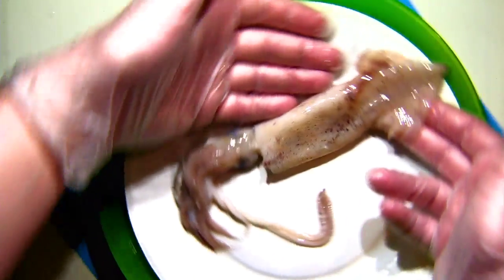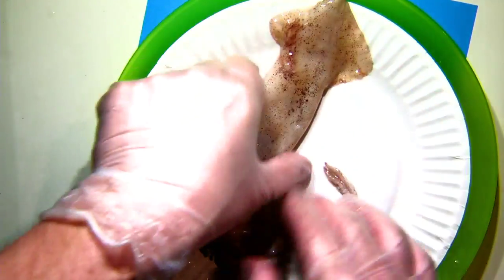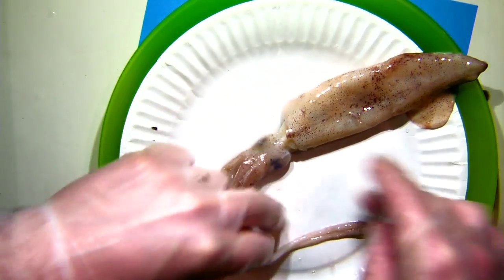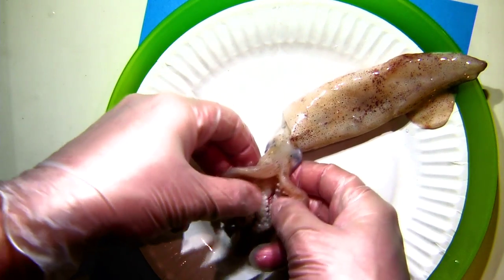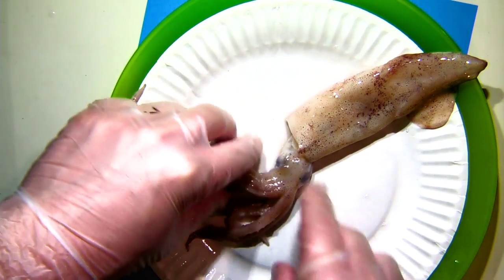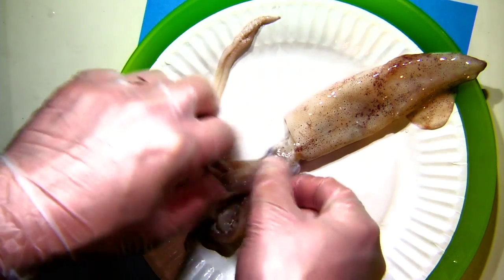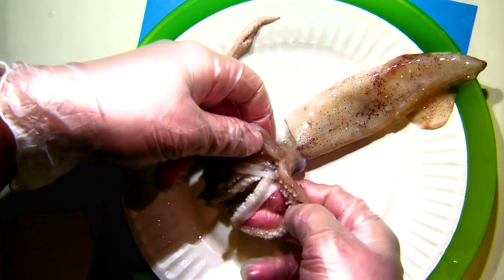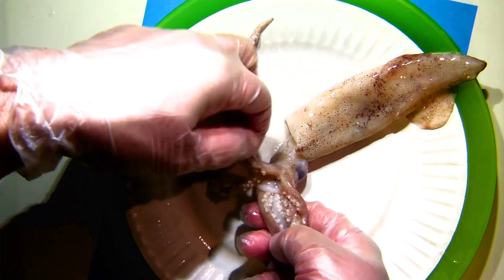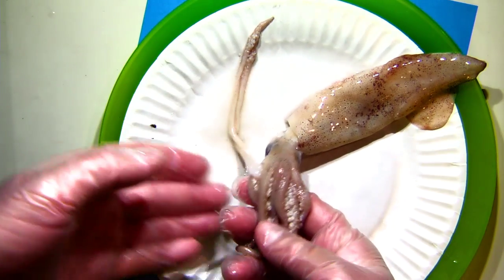We'll talk about how those fins work in a minute. You can also see sticking out the other end — we've got some arms. How many arms does a squid have? You probably know that octopus, which are a cousin of the squid, have eight arms — that's what they're named after. Let's do a count: one, two, three, four, five, six, seven, and eight. So that's eight arms.